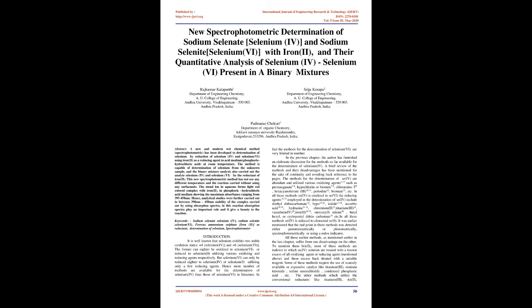Keywords: sodium selenate selenium(IV), sodium selenite selenium(VI), ferrous ammonium sulfate iron(II) as reductant, determination of selenium, spectrophotometer.